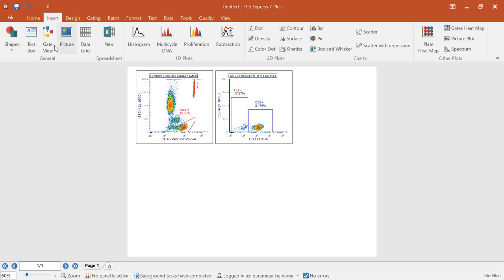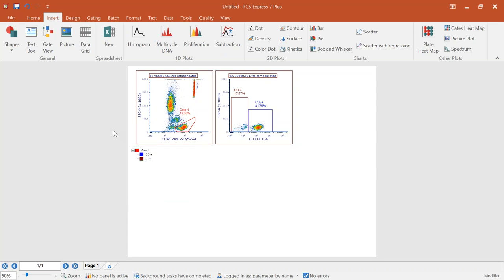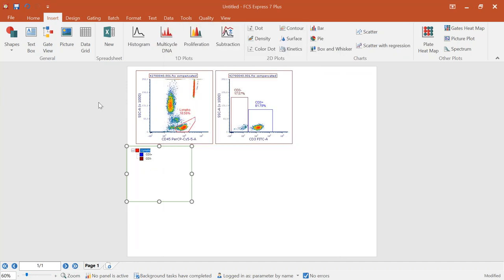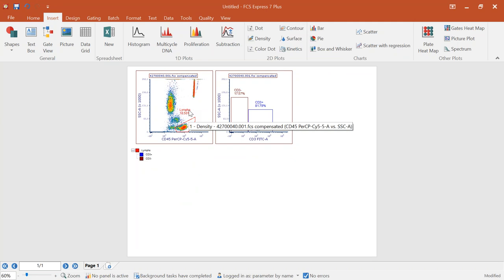The gate view is also a great way to manage your gate names and gate colors. I can double-click on this and if I want to change it from 'gate 1' to 'lymphs,' I can do that, and it's going to update wherever that gate name is. So if I have the lymphocytes gate displayed on multiple charts, I don't need to go back and change it over and over again.